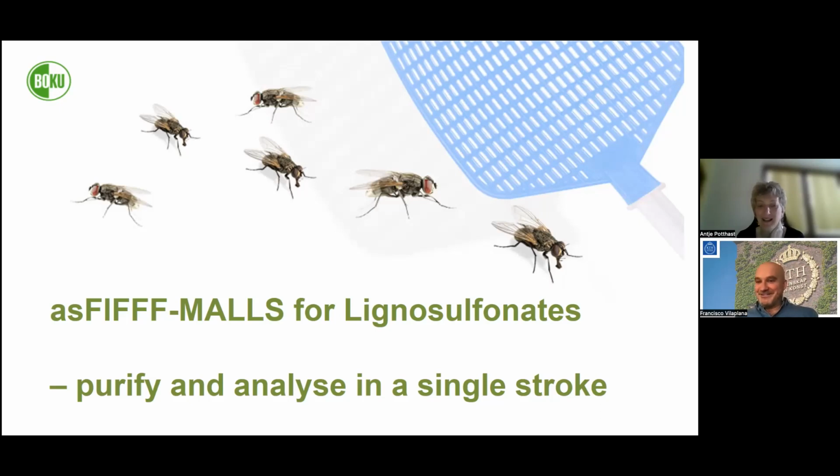Yeah, this is like a copolymer or something. I would say it will change because of that dispersity we have. So we will make a certain error there for sure. And there's no way to address that, as far as I know, in the software. So we can split the peak into different parts and use a different dN/dc, but then you have to put it together again, which is not so easy to do. On the other side, you can calculate how large your error is, and it depends how strongly your dN/dc changes. And we measured a lot of dN/dcs for different lignins, and it's not extreme, I would say.